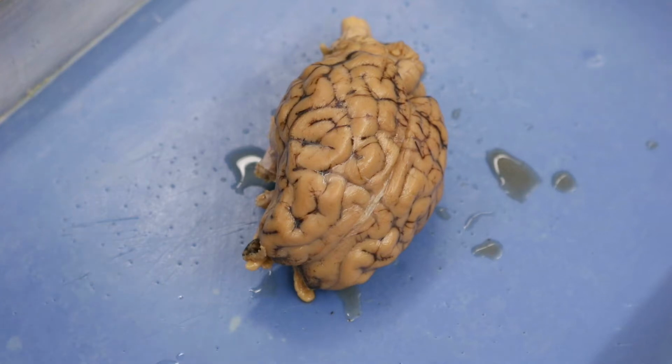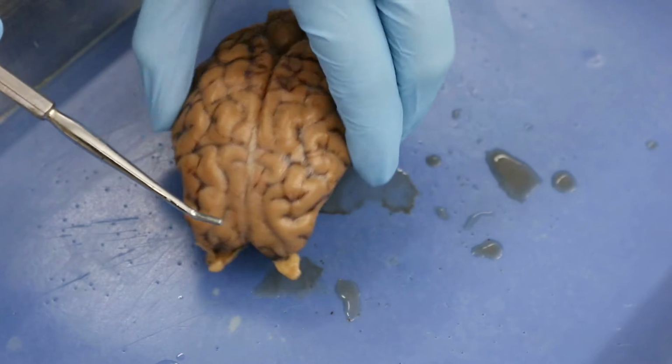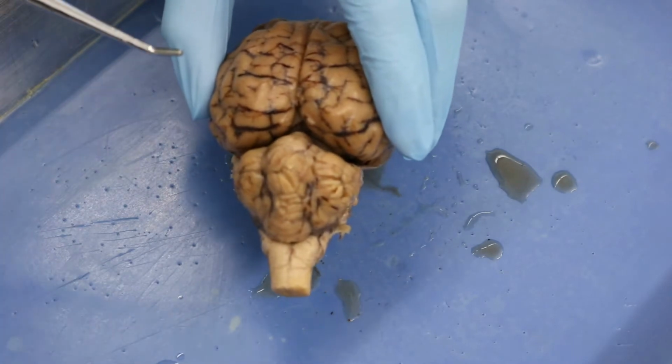All right, guys, so we are going to be starting with our sheep brain dissection today. So as you can see, this is a sheep brain. We currently are looking at the superior surface. This is the anterior aspect, and this is the posterior aspect.